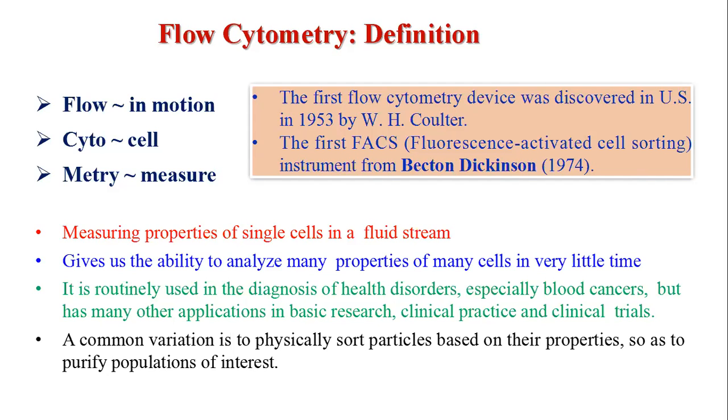This instrument gives us the ability to analyze many properties of many cells within a very short span of time.